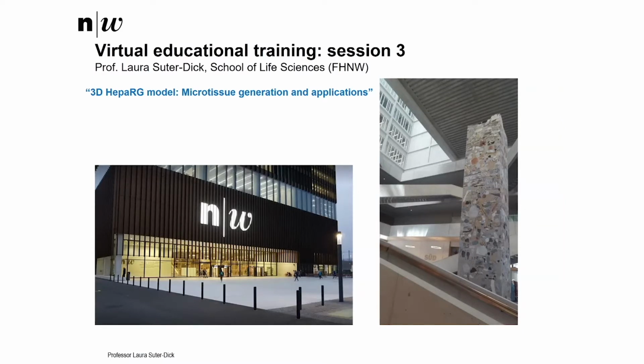So we have pre-recorded this because otherwise we would need like three days to show all the steps that we need to do. So this has been pre-recorded for you, about 25 minutes. And after that, of course, we will be open for questions and answers. And the title, as you know, is the 3D HepaRG model, microtissue generation and applications.